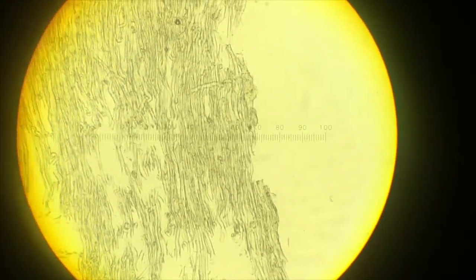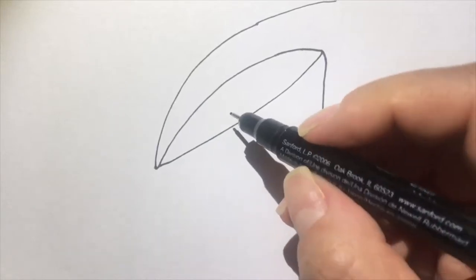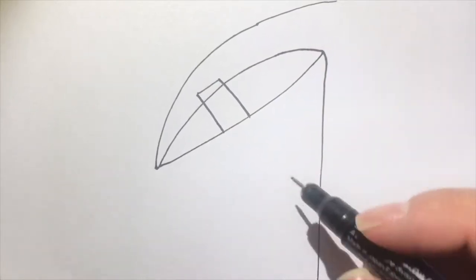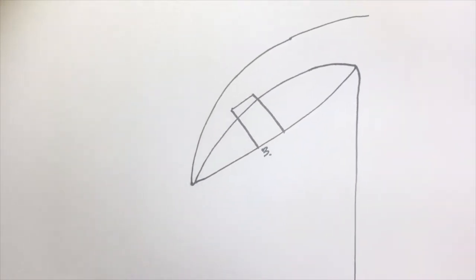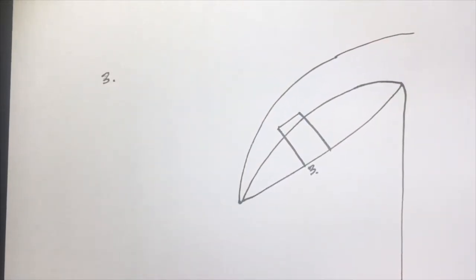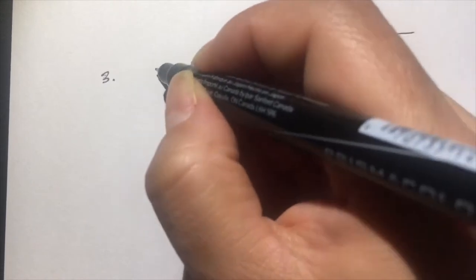Just gonna scroll so we can see what I've got. So you can see this is longitudinal. We wanna grab, make sure most importantly that we have the gill edge. And for this, we're also going to do a square. Now the square looks a little different. This was number three, gills. For this square, it's gonna look slightly different in that we're gonna end up looking at a tooth comb, and I'm sure you've heard that before. So the box, let's move the box here and see what it would look like.